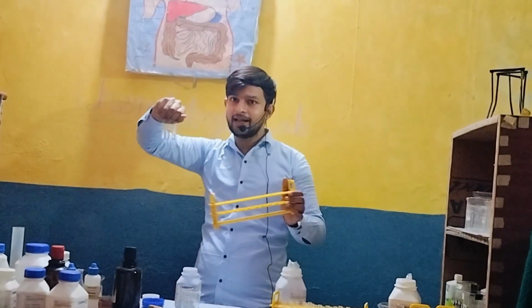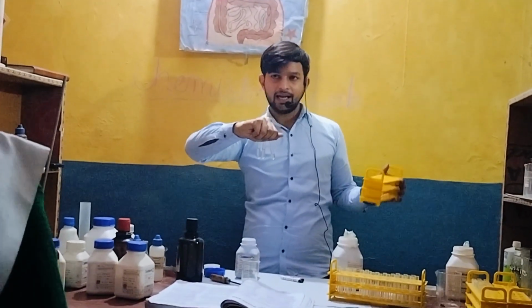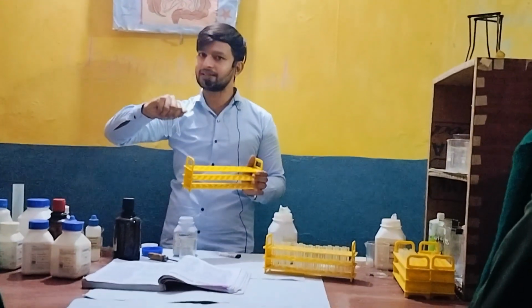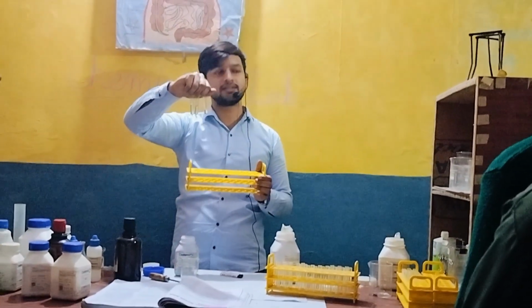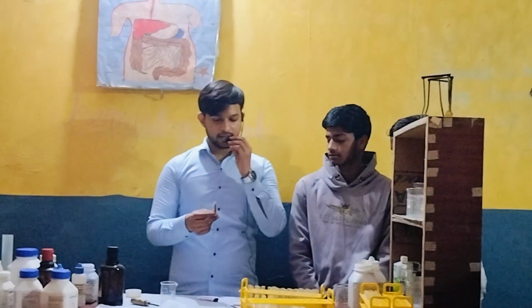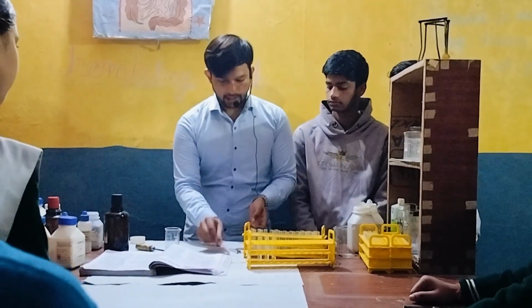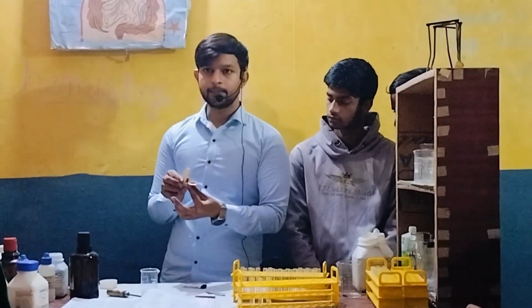So with the help of our natural indicator, that is litmus paper and then pH paper, and then the synthetic indicator, we have phenolphthalein and methyl orange. We will do experiment and then we can confirm that in which test tube there is acid, base and water. So let's start. Okay, please stop. Okay, so this is red litmus paper. Okay, and this is blue litmus paper we have, and this is pH paper.